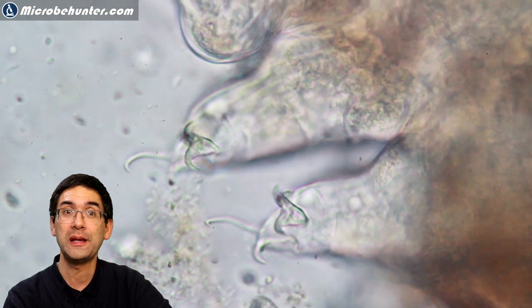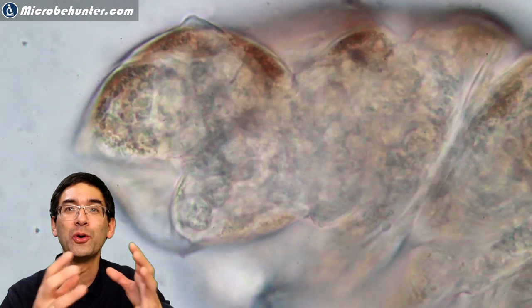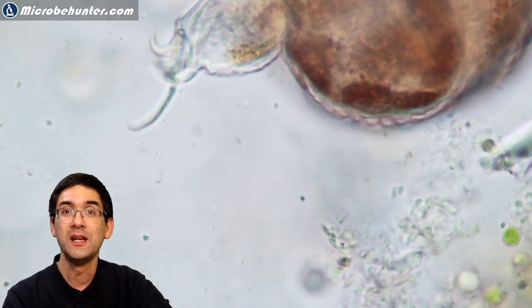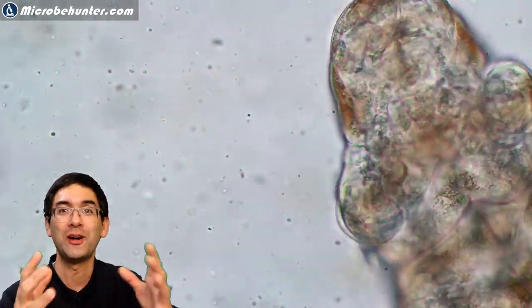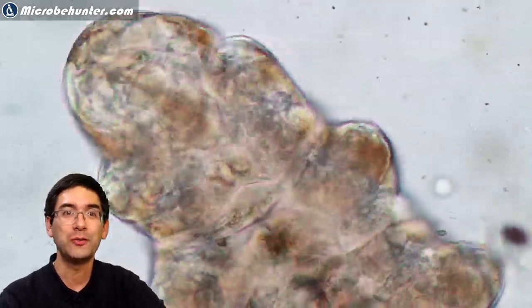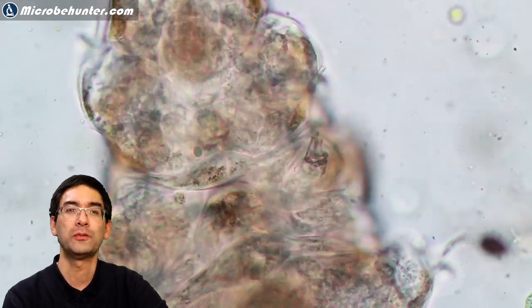Here again is a close-up of the claws. One of the things I also like about tardigrades is that they are semi-transparent, like many other water organisms, which makes it easy to see what's going on inside. Tardigrades are also interesting because they generally have a fixed number of cells within a species — so that's different from humans, where different individuals have different numbers of cells. Scientists can actually count the exact number of cells each tardigrade species has. It's interesting watching how the coordination of the eight legs happens.